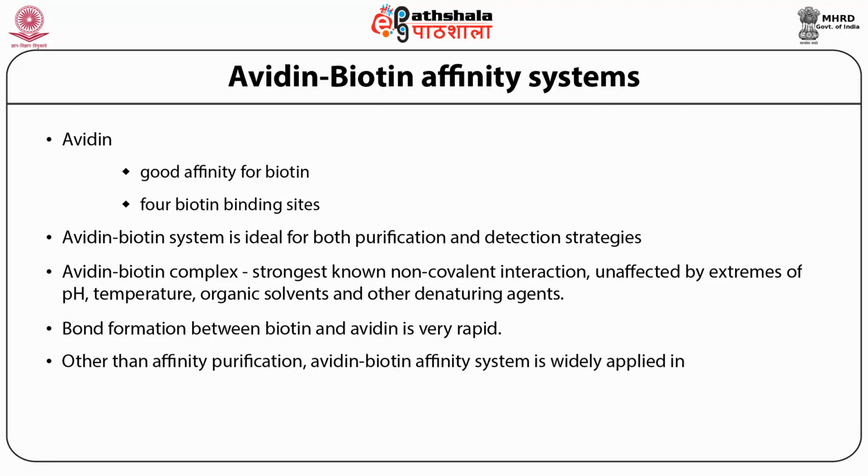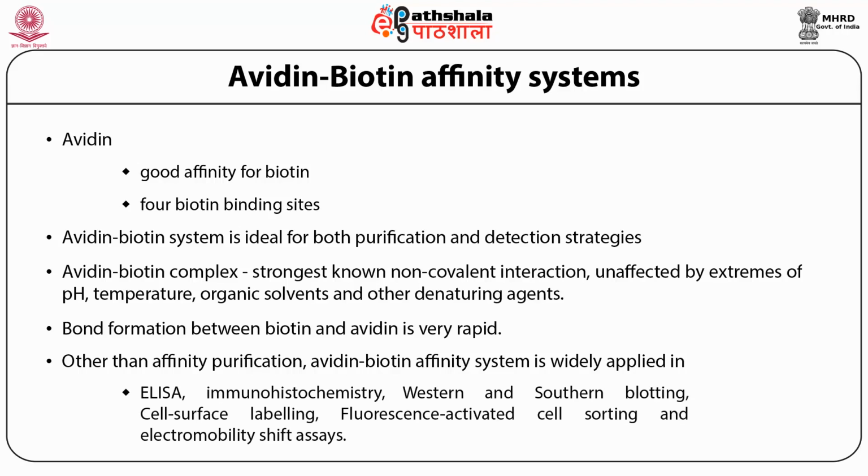Other than affinity purification, the avidin-biotin affinity system is widely applied in Western blotting, ELISA, immunohistochemistry, fluorescence-activated cell sorting, electromobility shift assays, and cell surface labeling.